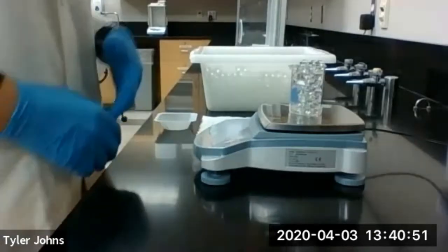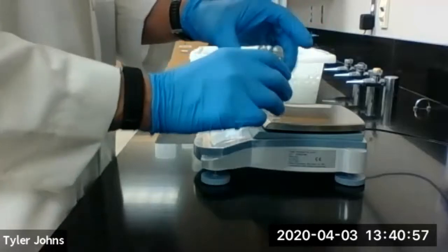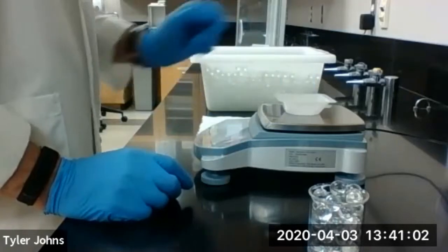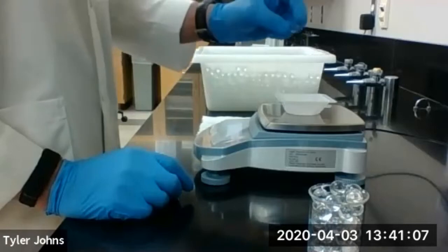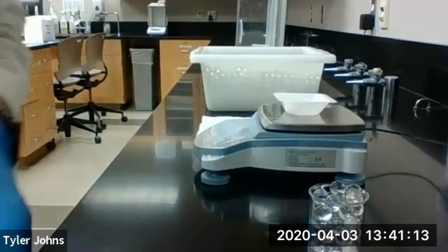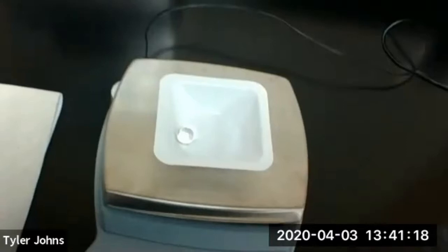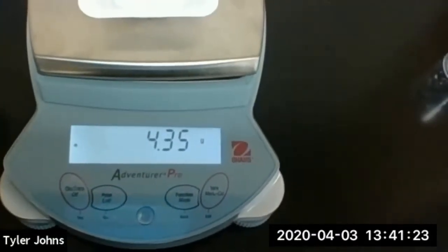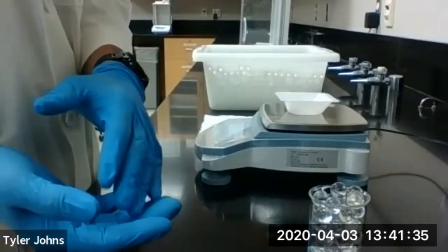So we next need to determine the mass of one marble. So we're going to set our beaker with our marbles aside. Place a weigh boat on top of the scale and zero it. And we're going to mass one marble. So the mass of one marble is 4.35 grams. So next you're going to calculate how many marbles are in the beaker.